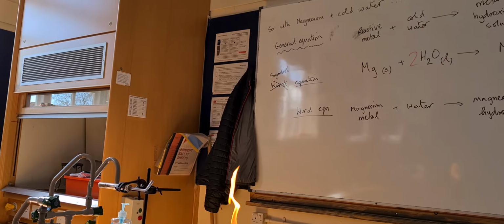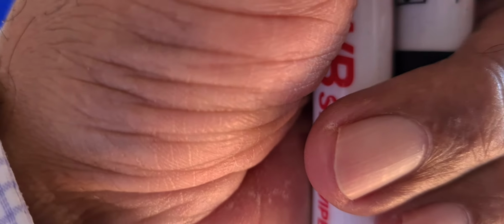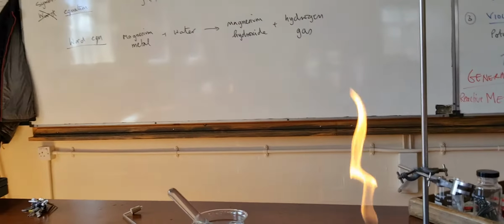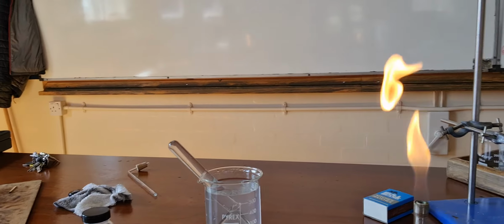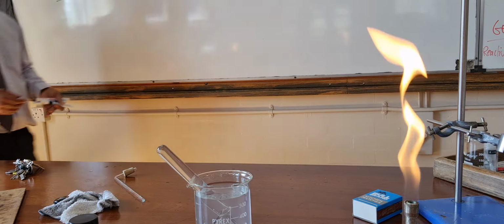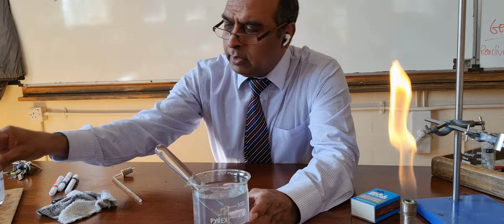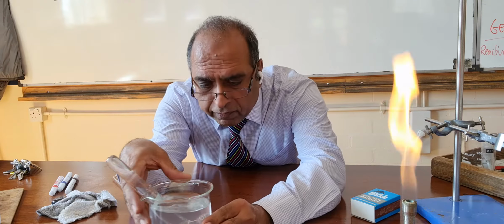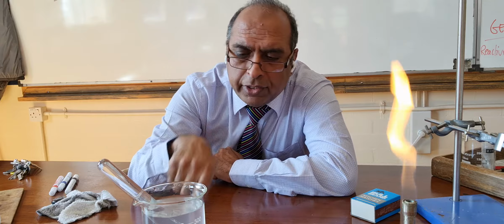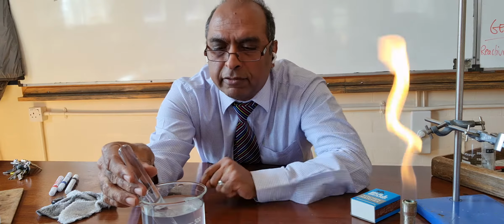Right. So let's put you back and get it round that way. Because, as I've shown you here, actually you can see the bubbles now. The bubbles are starting to form.